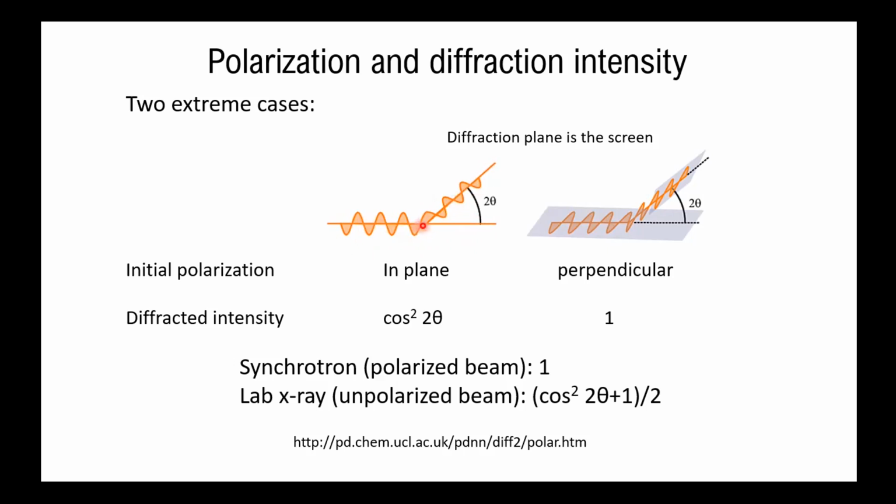So we have the incoming vector here, but it will actually be decomposed into 2 directions. But what is shown here is that this vector will not have decomposition in this direction, right? Everything will be maintained in this direction.